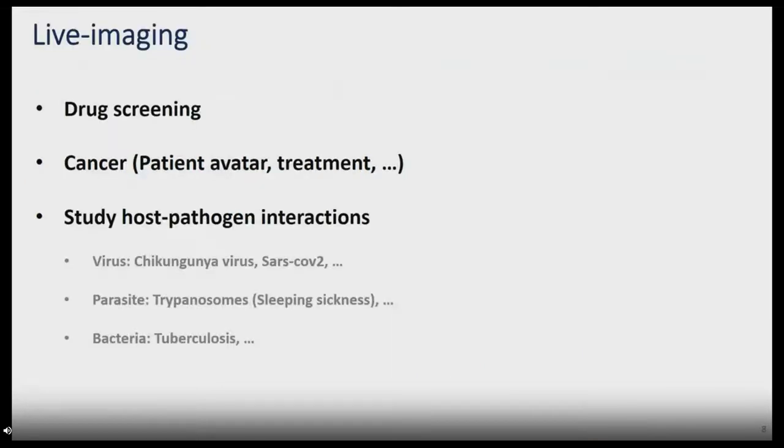So if we go a bit more into the live imaging now, as I said, the zebrafish is heavily used for drug screenings, for cancer fields. For example, a group in Portugal led by Professor Rita Fior is injecting cancer cells from patients into the zebrafish larvae, and then she evaluates how they respond to drugs, to chemotherapeutic agents. There are a lot of people working to study host-pathogen interactions on viruses, for example, with chikungunya virus, and even now there is a preprint about the coronavirus, by the group of Irene Salinas, Pierre Goudineau, and Jean-Pierre Lebroux.